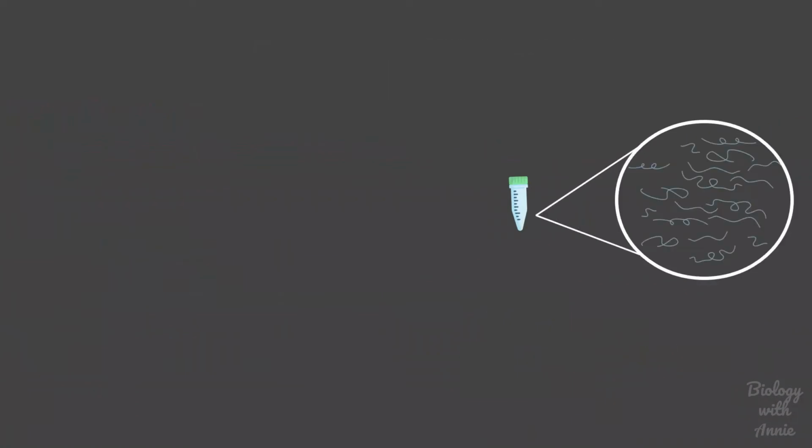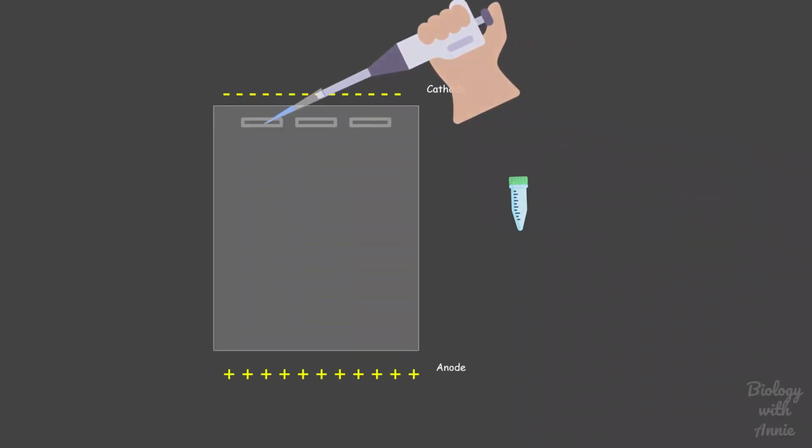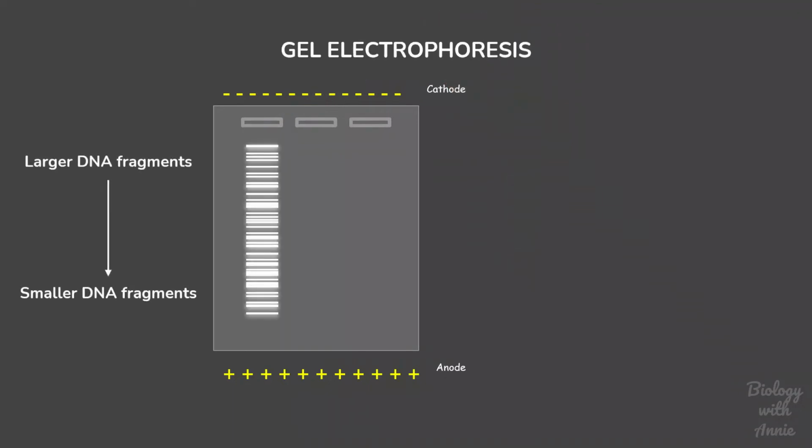These DNA pieces can be separated according to their length using gel electrophoresis, which uses an electric current to pull the negatively charged DNA through a mesh-like gel. This allows the smaller fragments to travel faster than the larger DNA fragments. Now we have the entire human genome fragmented and arranged based on their size. But what we really need is just the DNA fragments containing a specific VNTR sequence. To visualize only the DNA of interest, a DNA probe is used.